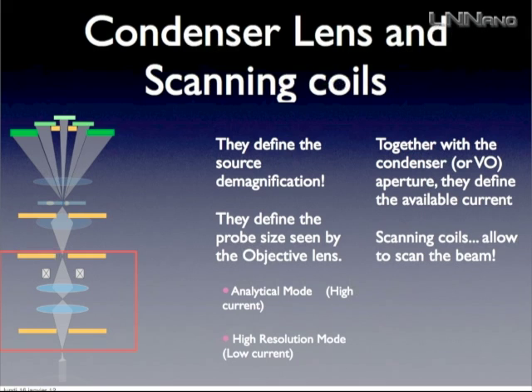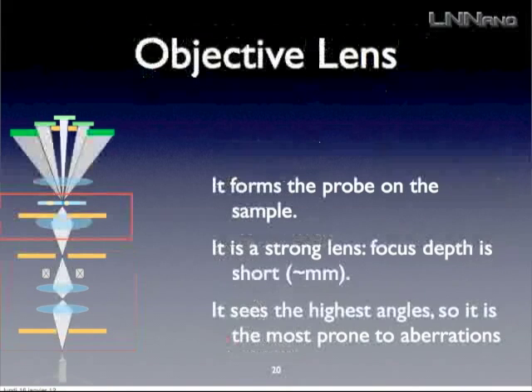But of course it's helpful to have an aperture, especially because you have a lot of aberration in a TEM, as you know, and an STM is just a regular TEM in that sense. So you want to cut this aberration, and then you need an aperture at some place. Okay. So usually before the sample, you also have scanning coils, of course, because you want to scan the beam. Otherwise, it's not very useful.